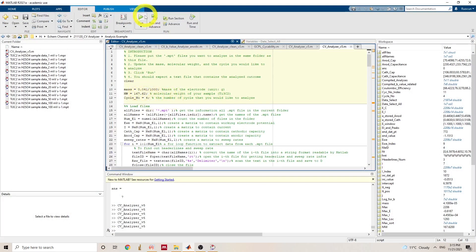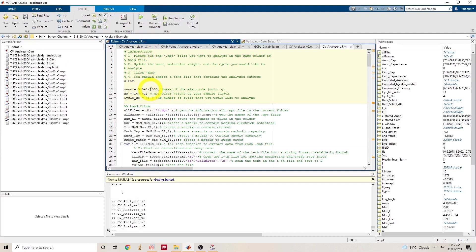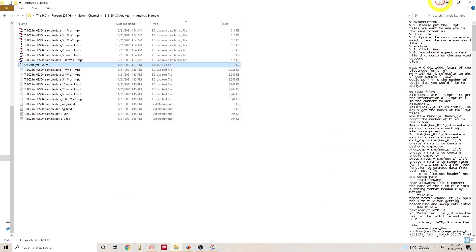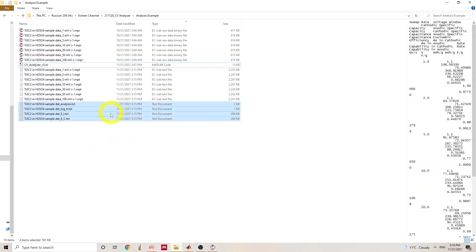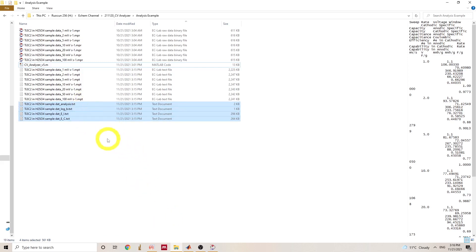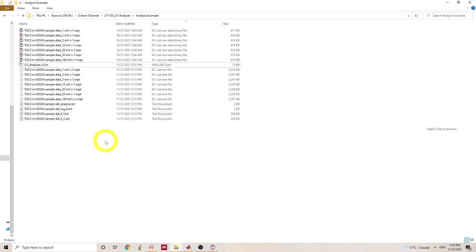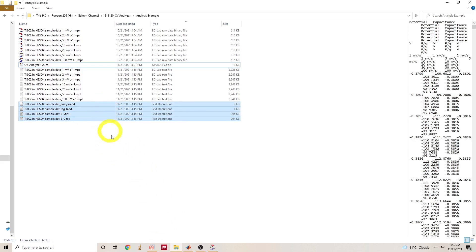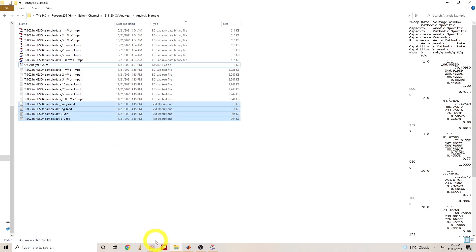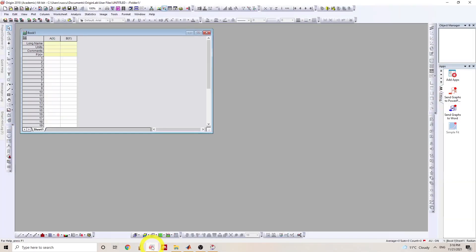So to do the analysis, we just hit run here. And the analysis is complete. So back to the folder, we'll see four text files that's generated: the analysis, log B, EI, and EC. And I will show how to use them in a plotting software next.